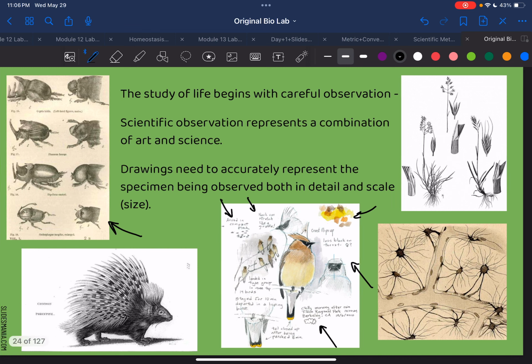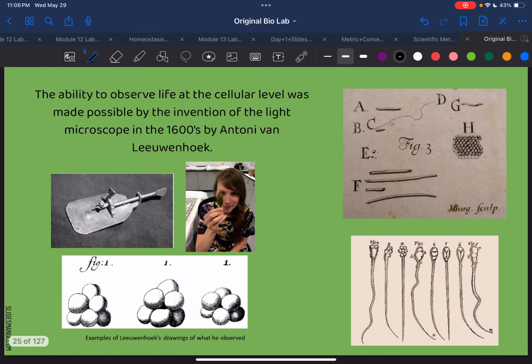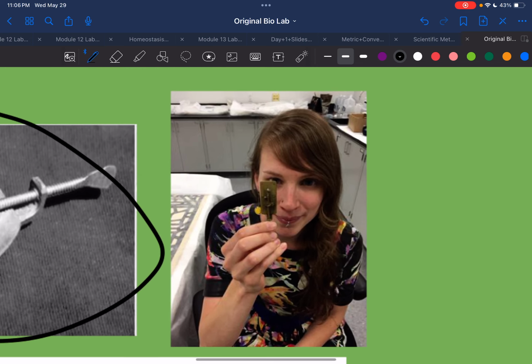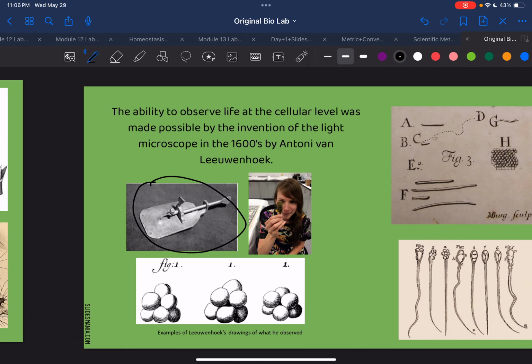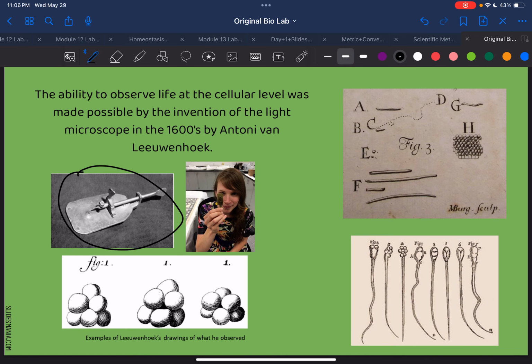So we talked about it a little bit ago, but microscopes were very, very important in giving us insight of the microscopic world. So here's the one by Anton van Leeuwenhoek, and you can see this lady right here is using it, and it just kind of looks like a tiny magnifying glass, but that was the start of something new.